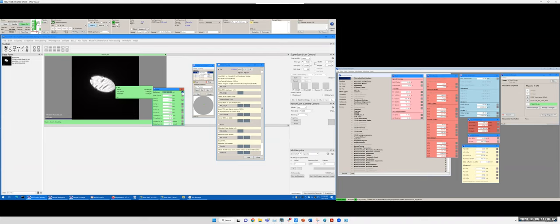Okay, somewhere like here. And then I click stop, I click enter, or I left click, and it will stop. And then I want to define this as the zero focus, at least for now. So you can define it by right-clicking this number, and you can see now the target will now be zero.